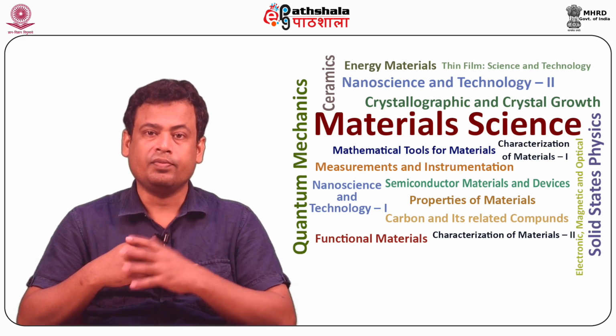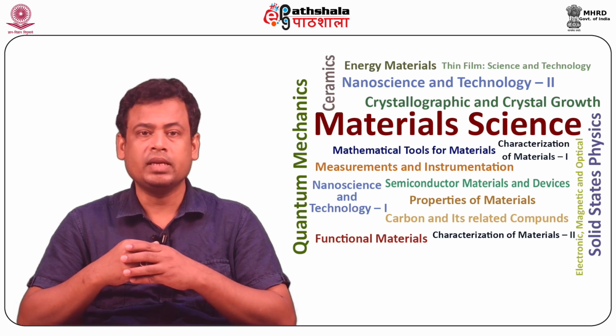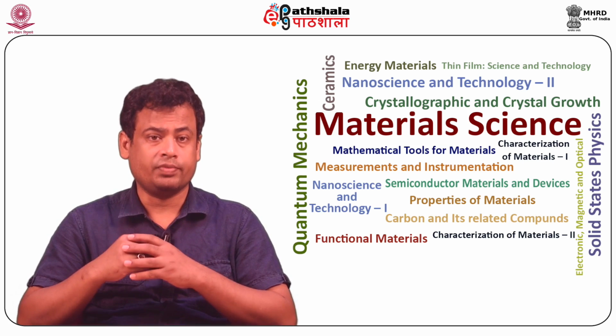The S for each element is experimentally determined and varies with conditions of the instrument and sample surface.